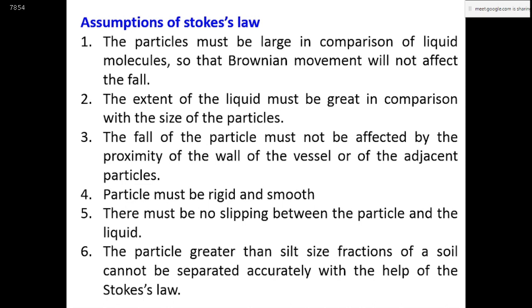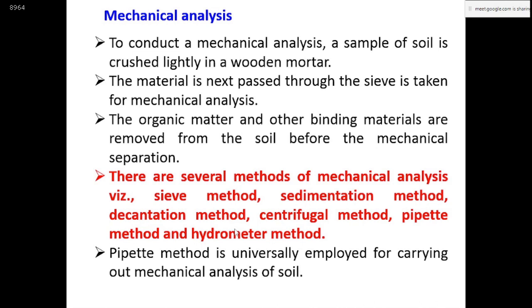If the particle is larger than silt size, then Stokes law does not work properly, because the heavier particles, or the particles having a higher radius, settle down easily, so less time is available for the suspended particles like silt and clay, which have a smaller radius.